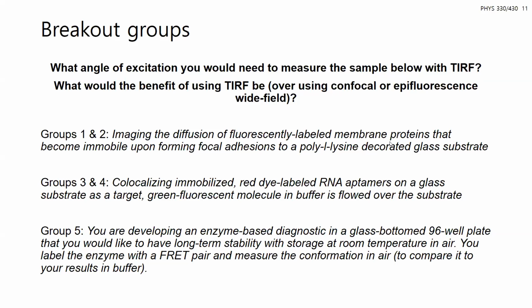We're group 4. For the angle, we used the indices of refraction of glass and of water for the buffer, 1.52 and 1.33. That gave us an angle of incidence of about 61 degrees, so anything greater than that. Okay, and the other group? We got above 59 degrees, so pretty close. We also used water and glass. Depending on how many sig figs you include or what specific glass you're using, it's pretty close. Okay.